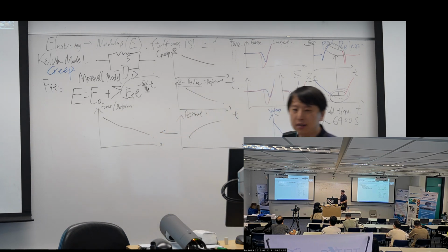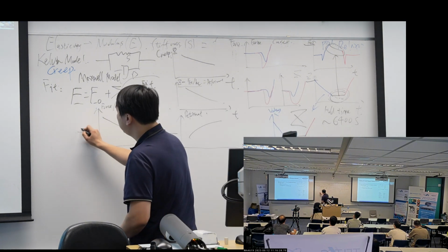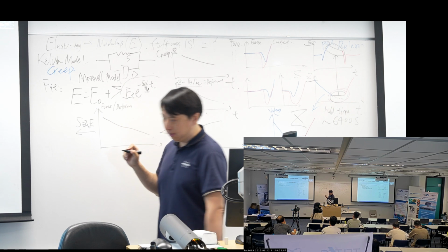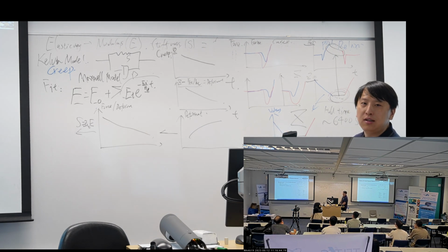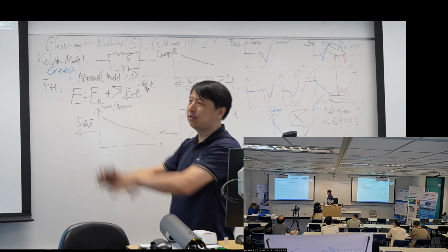So finally we get the stiffness. And after stiffness, it's still not the end of the story. We need to apply the Hertz model. Stiffness is proportional to 2a_c times modulus. So this a_c needs to be figured out by us. If we are using the Sneddon model, a_c is the deformation times the tangent alpha. If we are using the Hertz model, a_c is the radius.